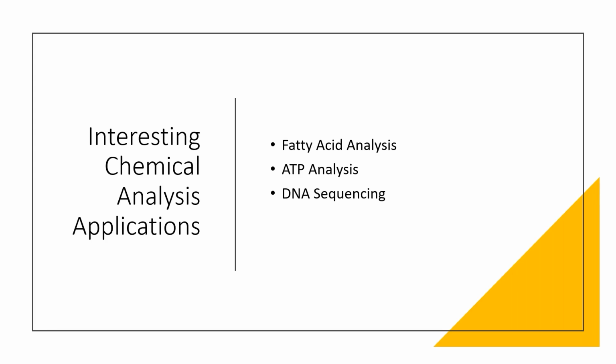ATP analysis is one that would be nice if a lot of plants could run more frequently. It gives you a sense for what the actual active biomass in your plant can be. That would be its main feature, but it also can give you a sense as to how much stress your system is experiencing. But active biomass I like to focus on because a lot of plants will look at their MLSS or MLVSS numbers and think that's all active bacteria, but in fact, 70% of it might be totally idle, inert junk that has no contribution, like dead bacterial cells or grit, just inorganic crystals or something like that. They all will occur and be measured in your MLSS and to some extent your MLVSS, but they're not actually active bacteria, which means they're not contributing.